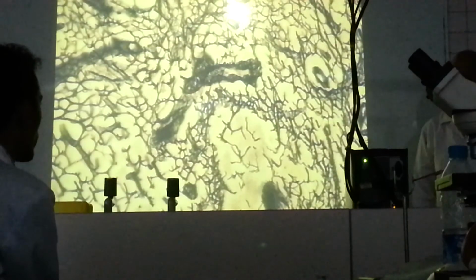So, what is the section? Reticular connective tissue. 2 points of identification: it appears by silver stain, forming a network of reticular cells and fibers. Okay? Clear? When we can find them, they support the parenchyma cells of organs. So, what is the name of the section? Reticular connective tissue. Why? The network appears brown by silver stain, formed of reticular fibers and reticular cells.